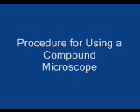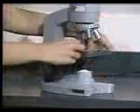The nosepiece can be rotated so that you can select a desired magnification. When first adjusting the microscope for a new slide, always use the lowest power objective and start with the nosepiece at its lowest setting.